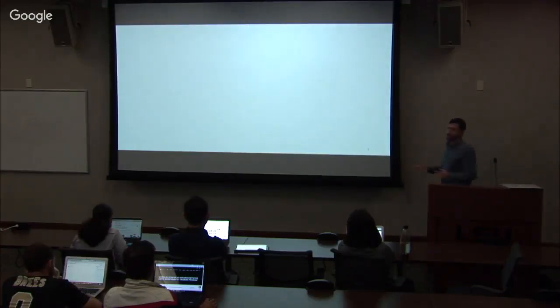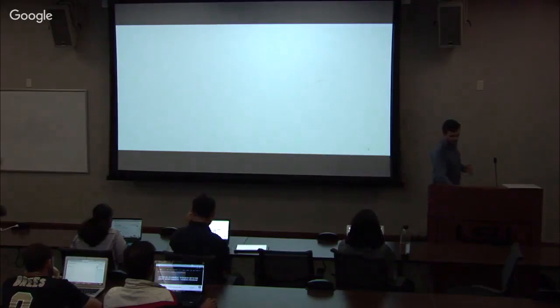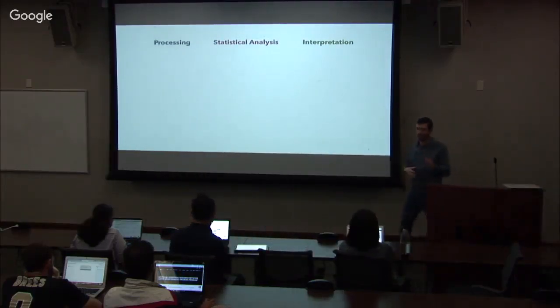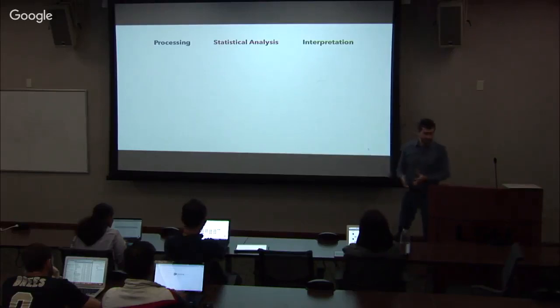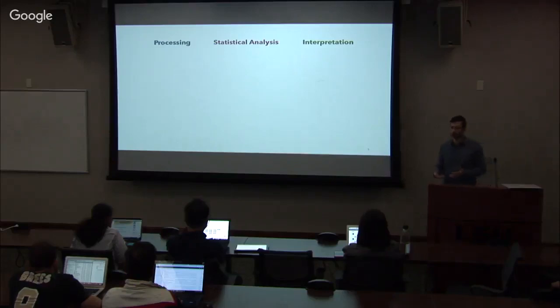So in summary, for the whole session, we will be talking about RNA-seq as a step-by-step process of preparing the data, which is processing, right? How do we structure the data that comes from the sequencer? Then how do we apply different statistical methods to understand what's in the data and do hypothesis testing? And then how do we interpret the results? So once we have them, how do we do interpretation?